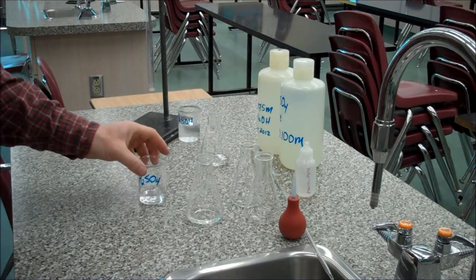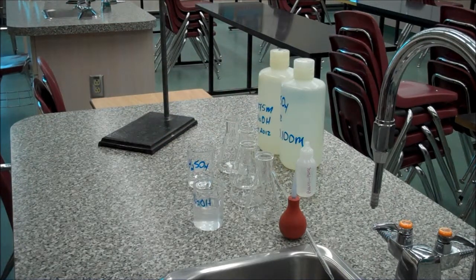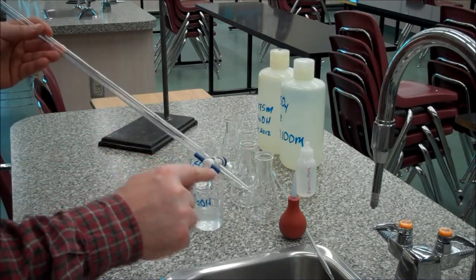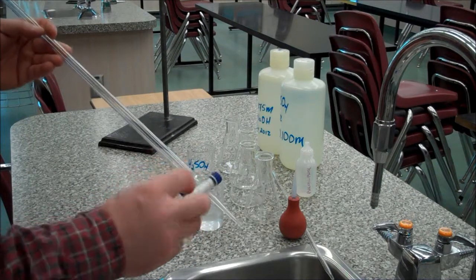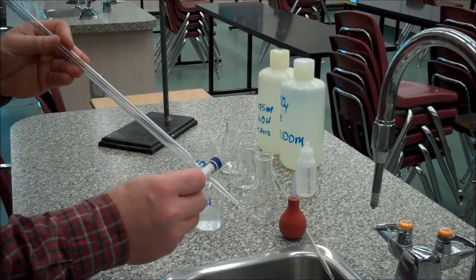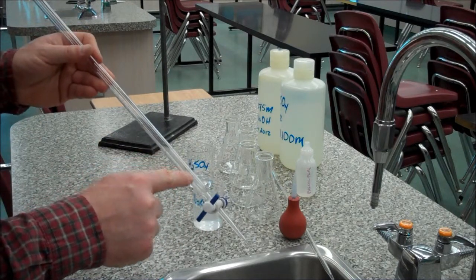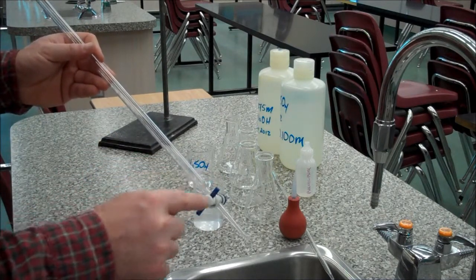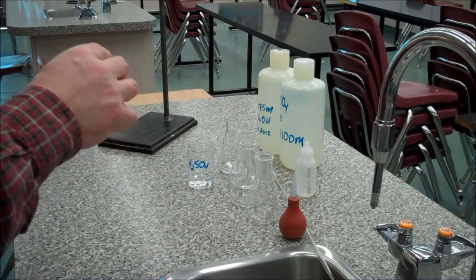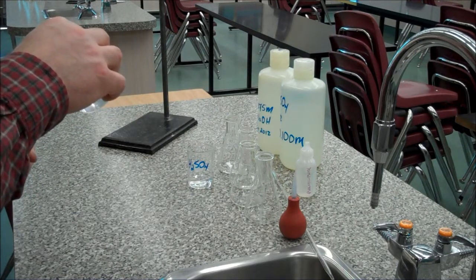And now I'll equilibrate my burette. Okay, when you first get your burette, the valve is open. That's the valve right here. They've all been serviced recently, so they should be pretty good, but you might need to check this little nut here to make sure it's tight enough. It doesn't have to be too tight, but if it leaks, you want to tighten that up a little bit. Anyways, when we go to put fluid in here, make sure you close this valve so it's straight across the glassware. Anyways, and we're going to put about 5 mL-ish sodium hydroxide in here. And I'll roll the barrel of the burette as I do it.